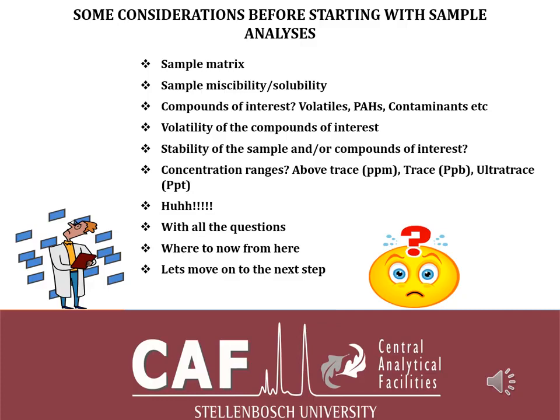Are you working with milligram per liter, which is ppm? I call it above trace. You can call it something else. And also, are you working a trace analysis, which for me is ppb, between 1 ppb and 1,000 ppb? That's trace for me. You can call it something else.